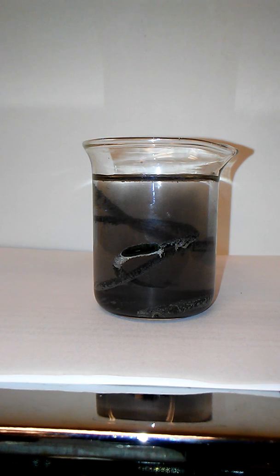Anyway, if you take a look at last period's here, and again, I'll have the video posted on Classroom later today, you can see there's a copper wire here, and then you can see the silver metal that has come out of solution. And the solution started out like this one here, a little bit clearer, but a clear to cloudy solution like that. And here it's turned obviously a blue color. That's because as the silver undissolves, the copper is dissolving. The copper is going into solution, and copper solutions tend to be a bluish color.